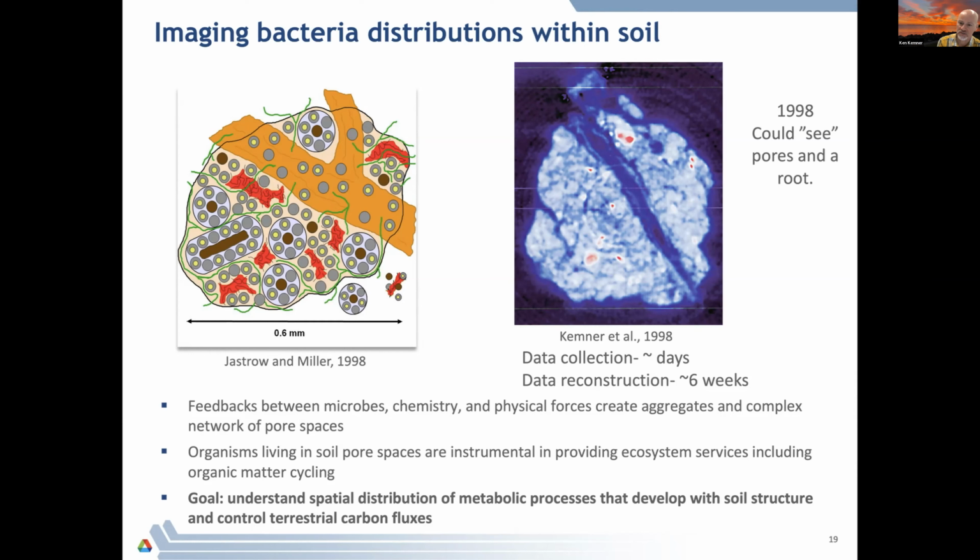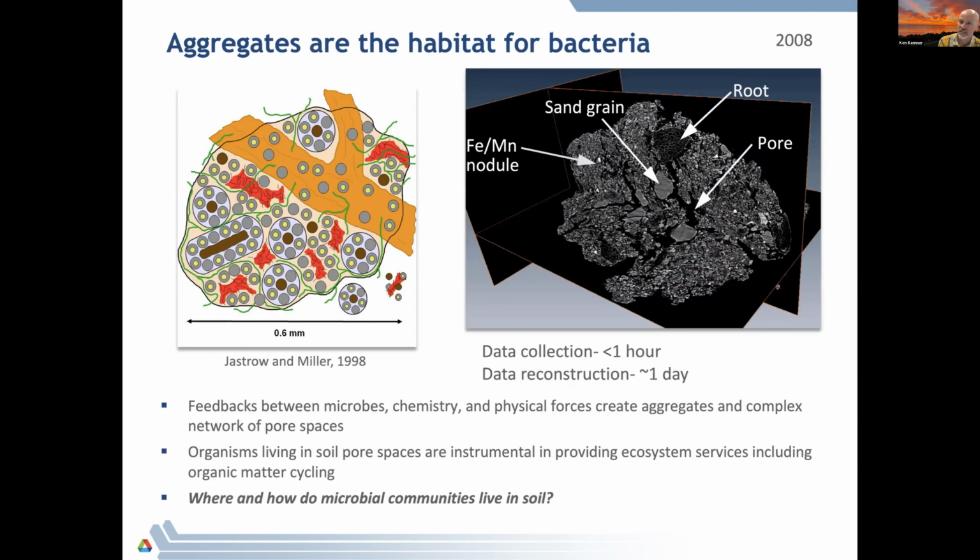So it was a tour de force measurement back then, back in '98. Fast forwarding about 10 years, you can see the advances that were made looking at soil aggregates. Now we had data collection at that time that was less than an hour on a single soil aggregate. And the reconstruction took about a day.